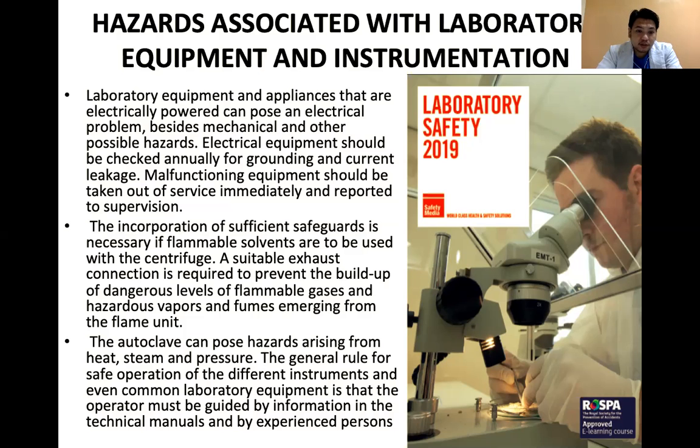So for example, lalong-lalo na sa laboratory, we have hazards on microtome since it has blades, can cause slicing of your fingers.